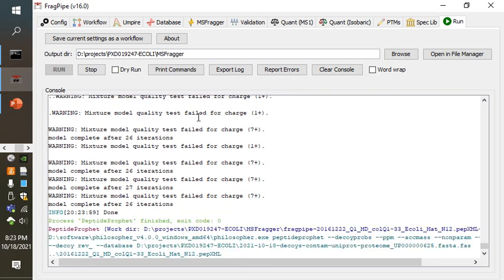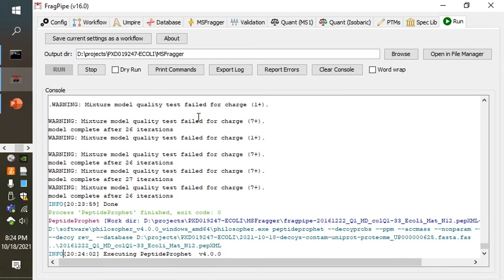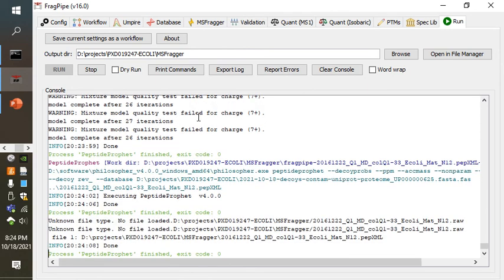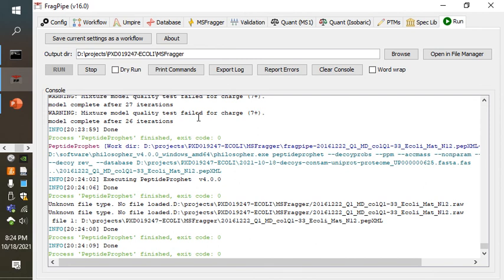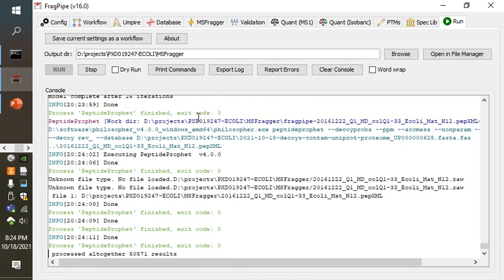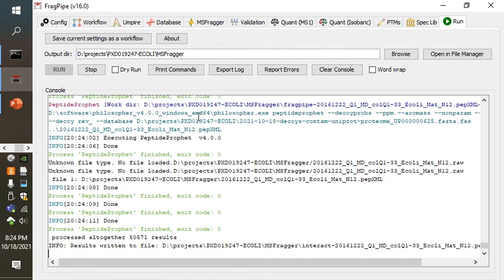So in effect, this mixture model that it's fitting is trying to determine what the shape of the PSMs for decoys look like, and it knows that those are the falses. It can then try to match the rest of the distribution, those represented by higher scoring target matches, as a way to find where the true distribution is located.